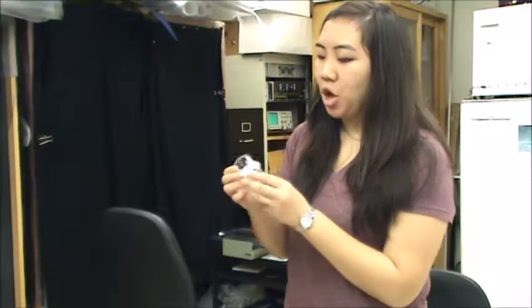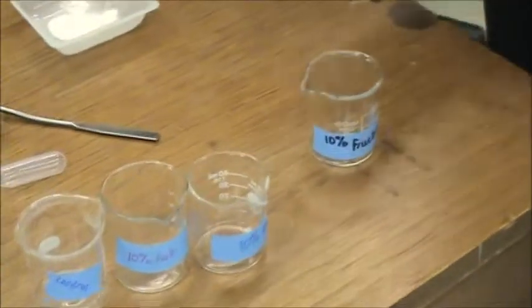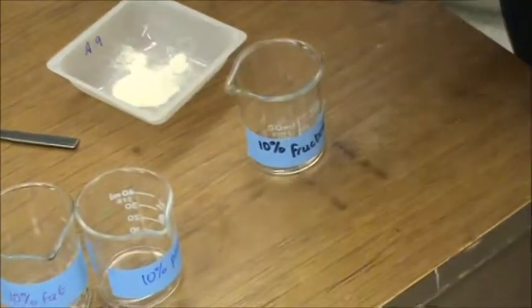So the first thing you want to do after you've collected all of your ingredients is label all of your beakers. So since we have 10% fructose, I've already labeled a beaker and you just put both the fructose and the agar into the beaker.